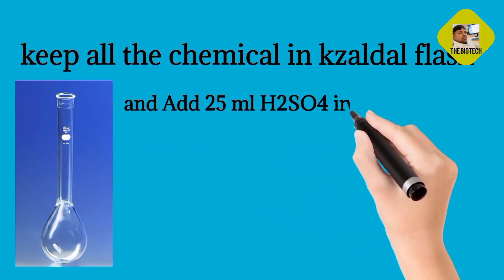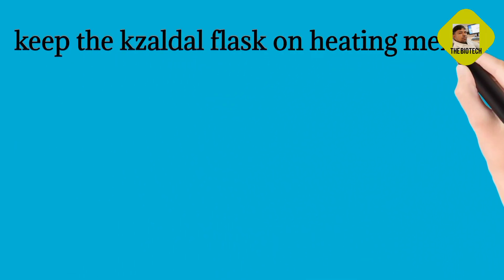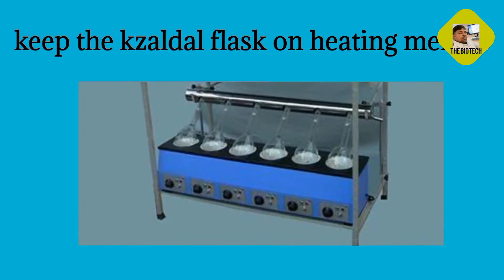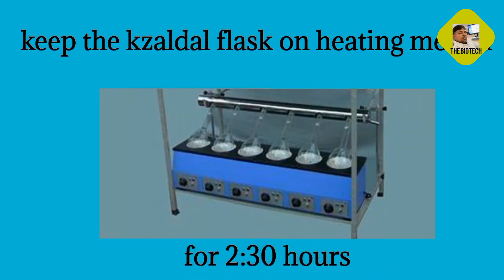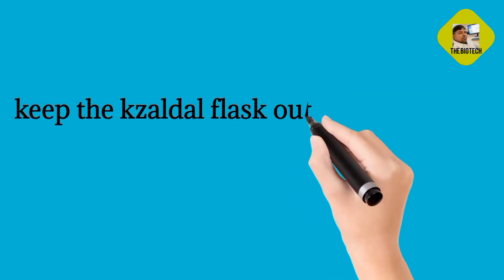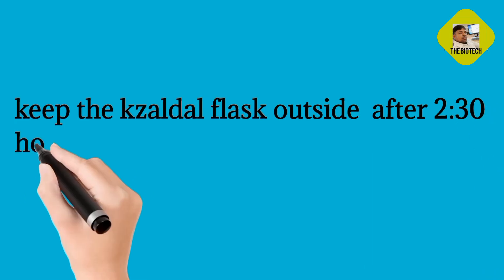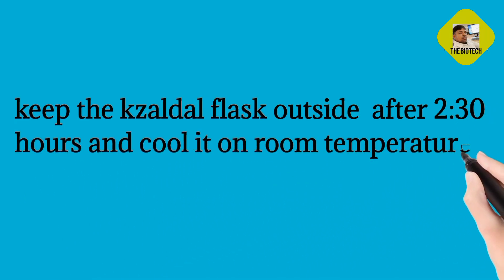Add 25 ml H2SO4 in the Kjeldahl Flask. Keep the Kjeldahl Flask on the heating mantle for 2 and a half hours. After 2 and a half hours, keep the Kjeldahl Flask outside and cool it at room temperature.